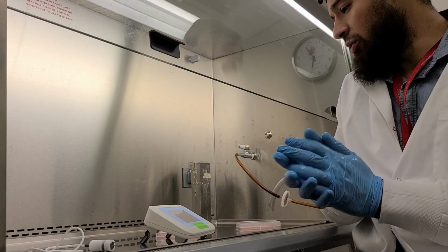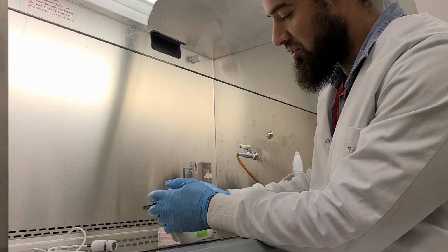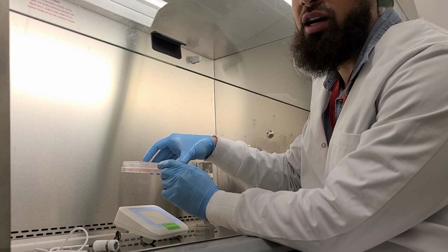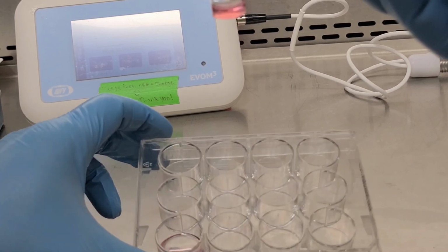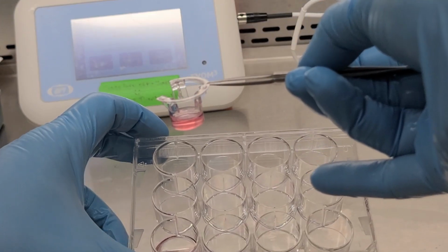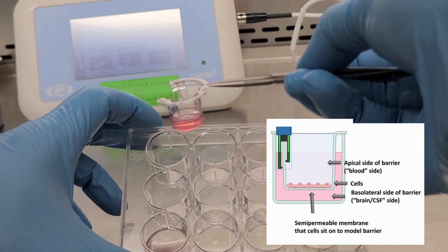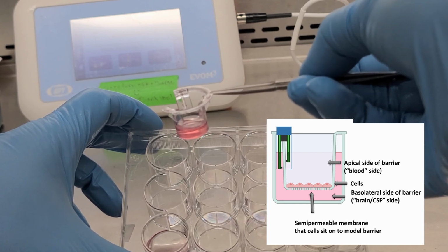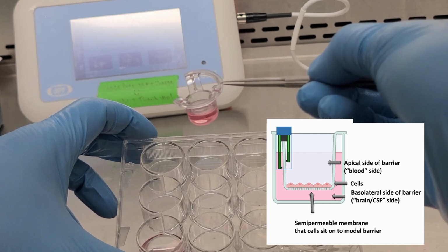Okay, so what I'm doing right now is I'm going to measure barrier function, because I am working with brain endothelial cells, and my plates have these transwell inserts. These are used to model barriers. The idea is, at least in our case, because we're modeling the blood-brain barrier, the media at the bottom essentially represents the brain side of the barrier. So these would be the contents of essentially the CSF, the cerebrospinal fluid. And the media on the top essentially represents the blood.